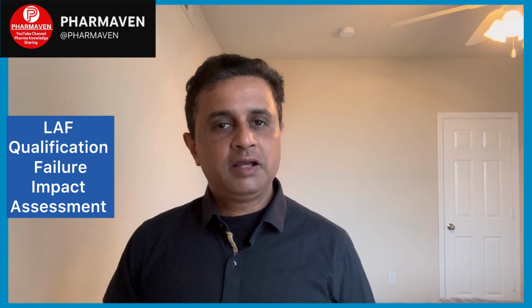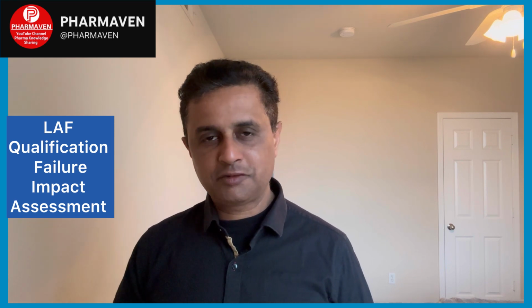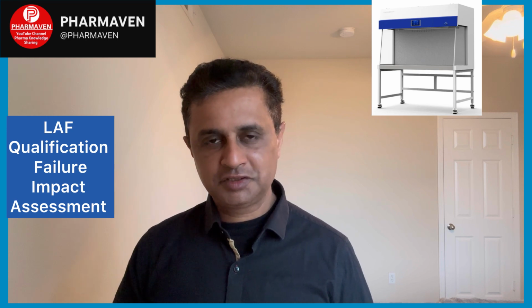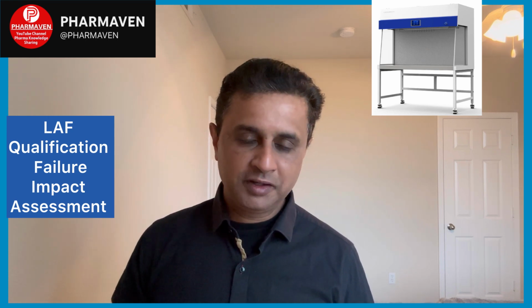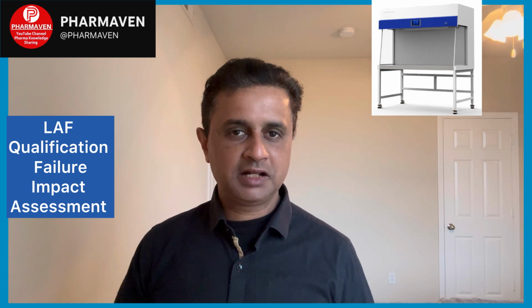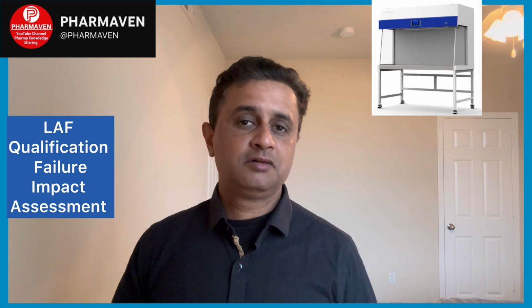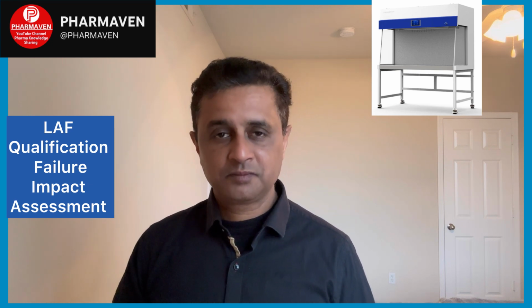Review any changes made to the LAF since the last requalification: whether there was any change in the procedure or cleaning procedure, whether any modifications or breakdown maintenance were done on that specific LAF or LAF workstation.